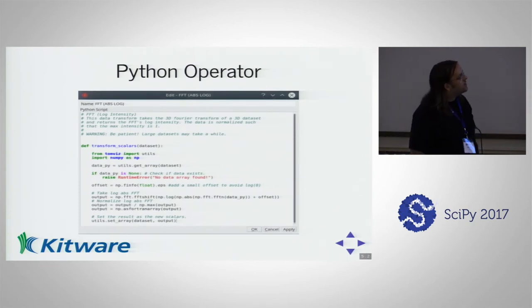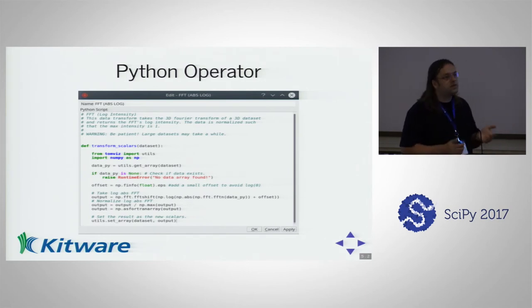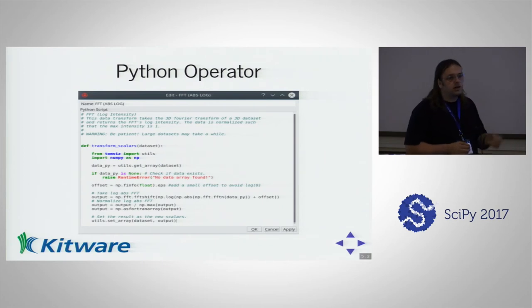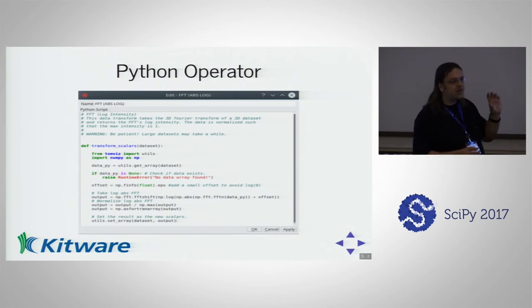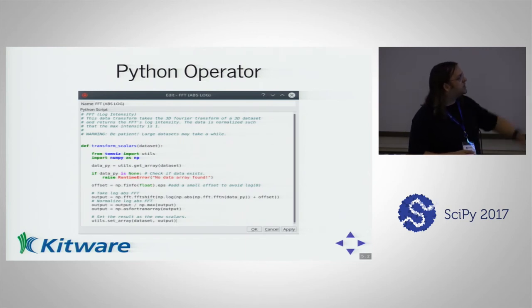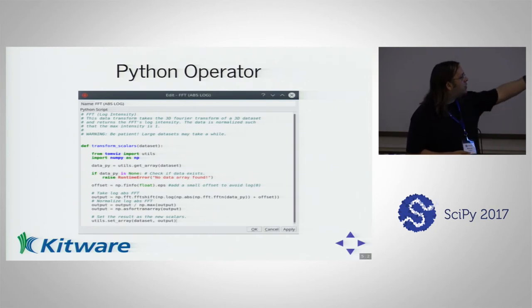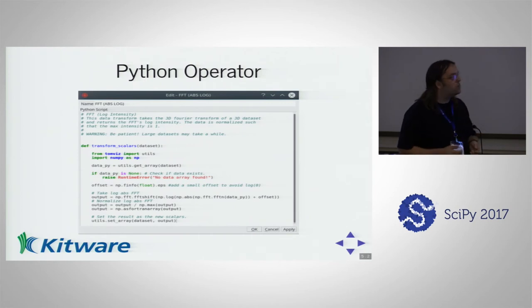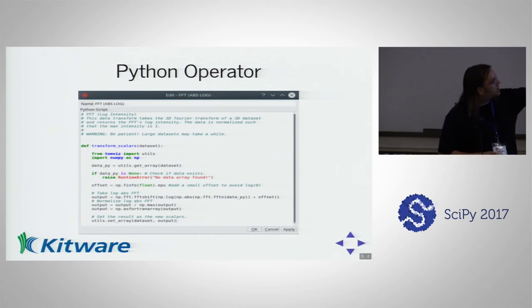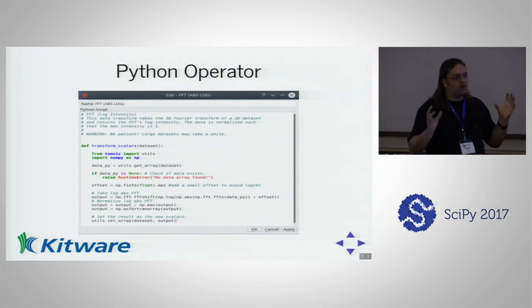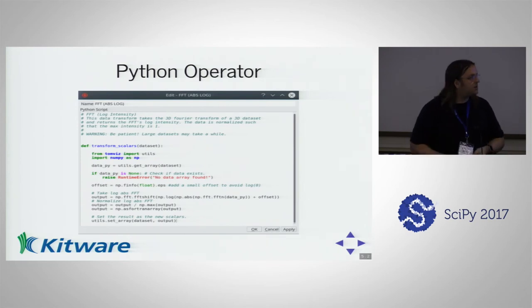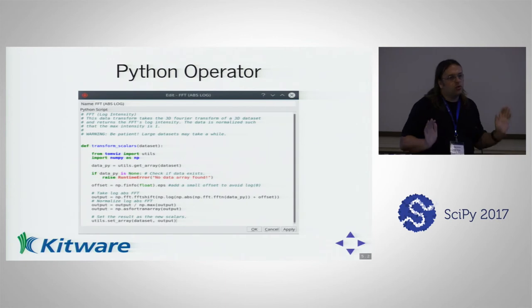A typical Python operator is presented in a dialogue. They're stored in our source tree and reviewed the same as the rest of the code on GitHub, but you can also edit them inline, and when finished you can save them to the source tree and submit a pull request. They generally bring in TomViz helper utilities, which provide a mediation layer between the VTK data types in the visualization pipeline — letting you bring them in as a NumPy array, taking care of shaping it properly. You can apply pretty much any NumPy operation on the 3D volume, and at the end you set the array as output, which gets converted back into the VTK world. It's fairly seamless to do all the intermediate steps in normal Python scripting.